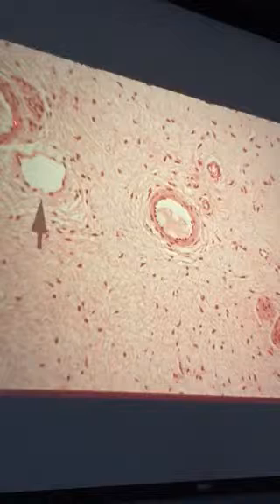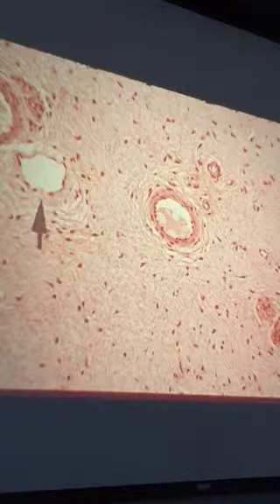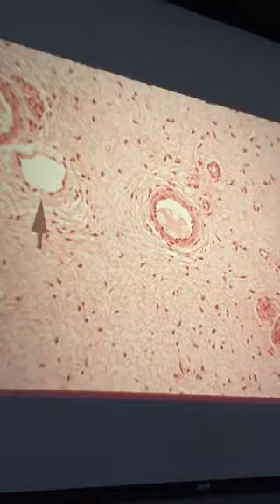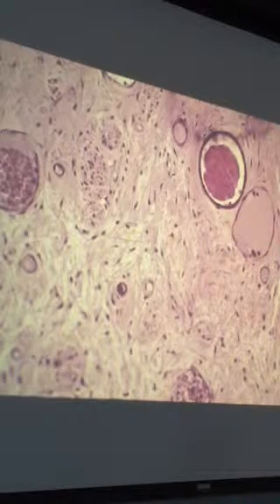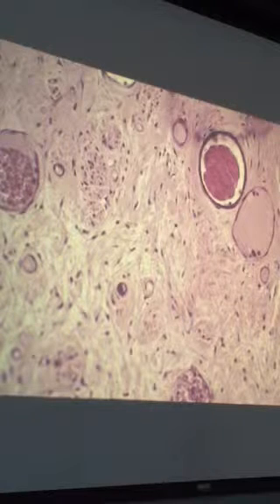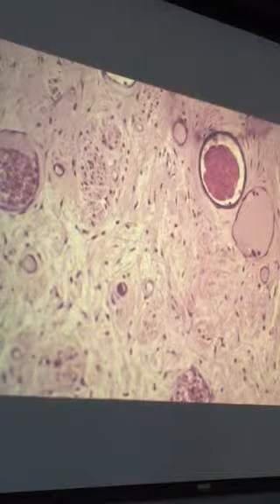Okay, and so we have a couple of arterioles there. We have some capillaries. There are a couple of nerves. And let's go on to the next slide. Probably a venule right there. And that right there, what is that? Nerve in process. And possibly a lymphatic vessel over there. And I don't see right offhand anything that looks like a pericyte.